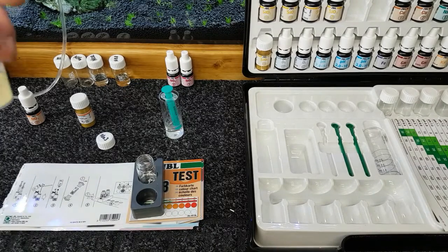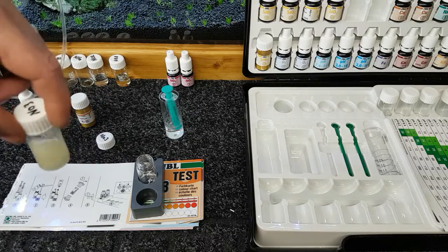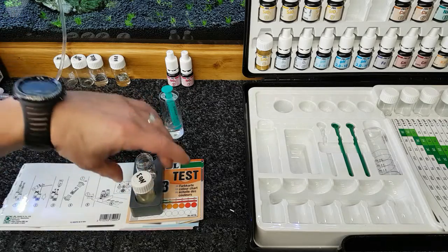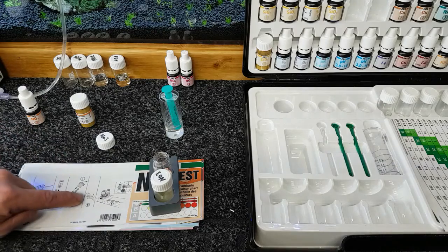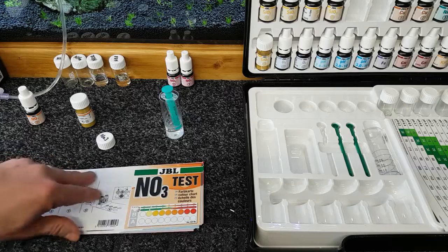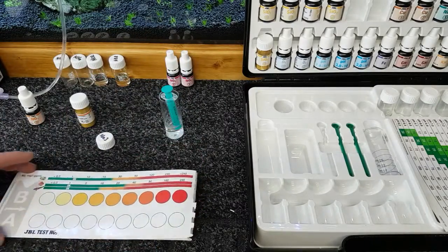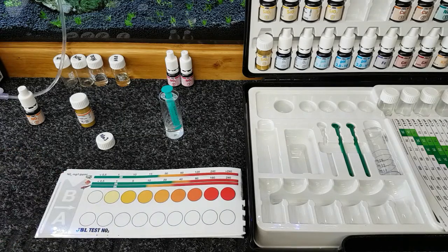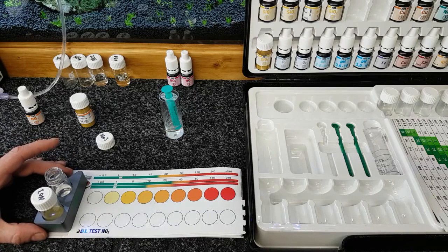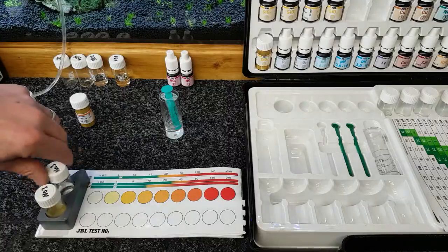Right, I've just shaken the life out of this. As you can see, it's got that yellowy colour. A little bit of powder left at the bottom. That's probably going to dissolve. And now we pop that back into there, and our little chart now is saying place back on the colour side, which is over here, and wait for 10 minutes. Back on the starting block there. I'm going to leave that for 10 minutes, okay? Let's pop that lid back on there for a second.